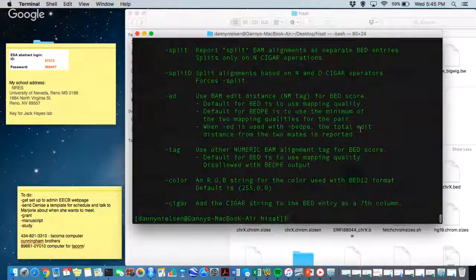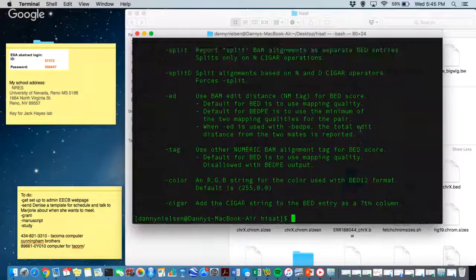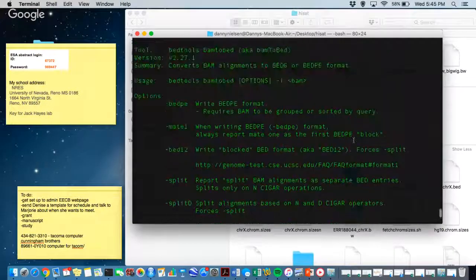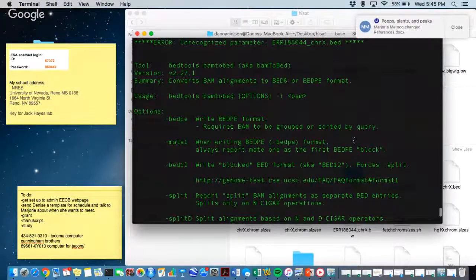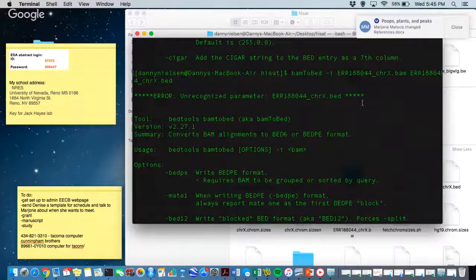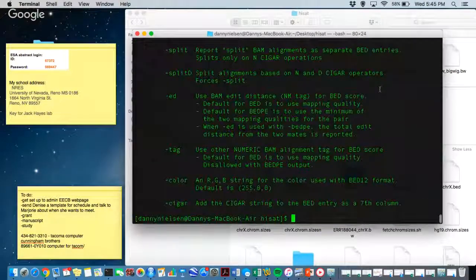Oh, I guess it didn't like that, maybe I can't do that. Oh, I see.